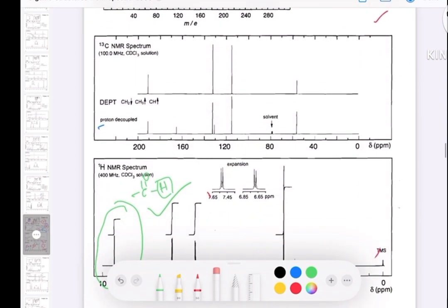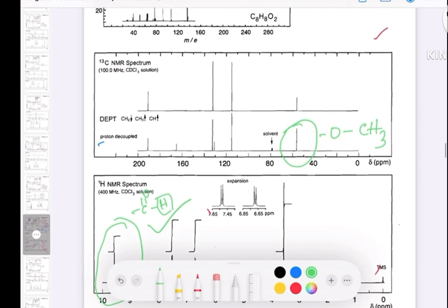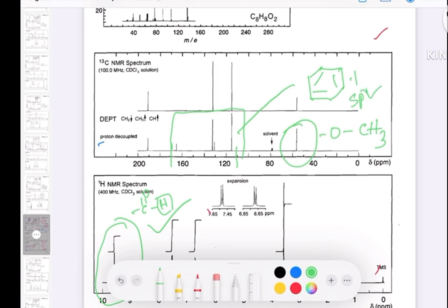Now in the carbon NMR, there is a peak around 50 to 60 ppm. A carbon in that region is typically an oxygenated carbon — like a methoxy or O-methyl carbon — because any carbon next to oxygen normally shows up around 50 to 65 ppm. So we have a methoxy carbon confirmed. Carbons from 110 to 160 ppm are aromatic or sp2 carbons, confirming the benzene ring.